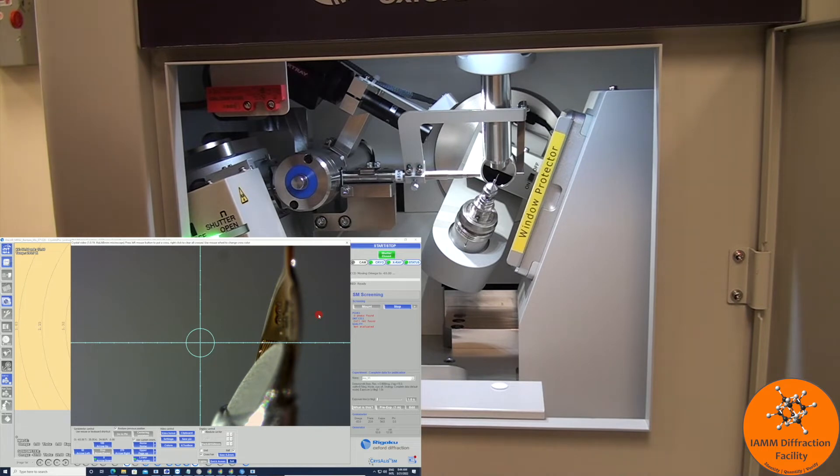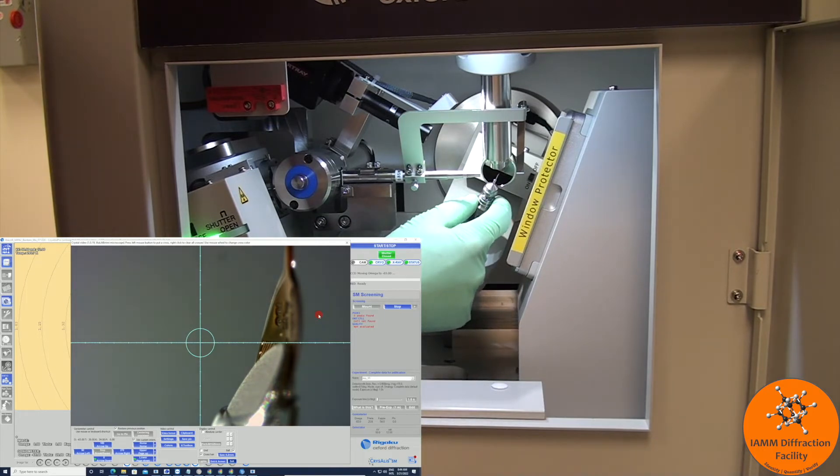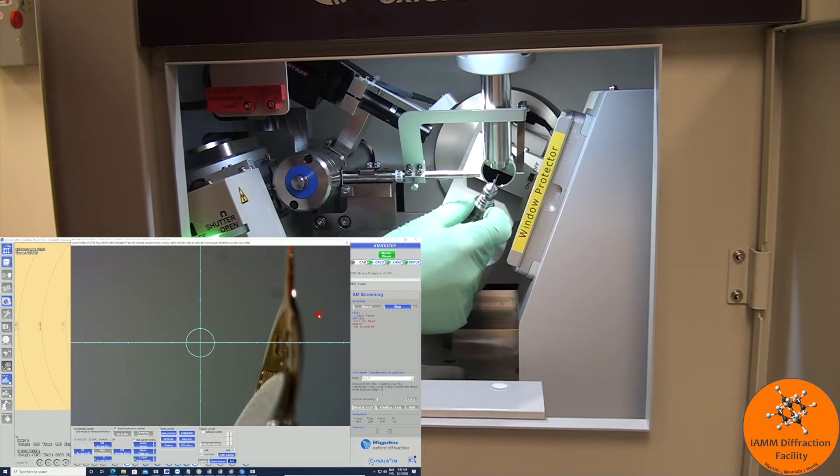Our goal here is to center the sample in the crosshairs. It is way too high right now, so if I rotate this kind of ribbed piece here, then I should be able to drop that down. Now we see our crystal.